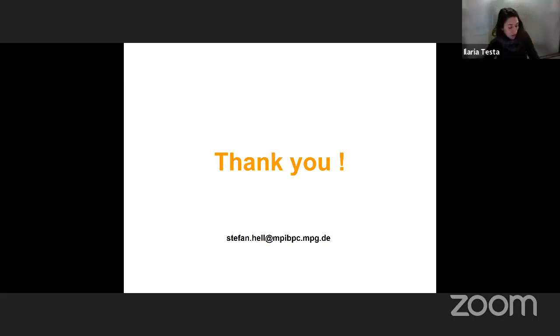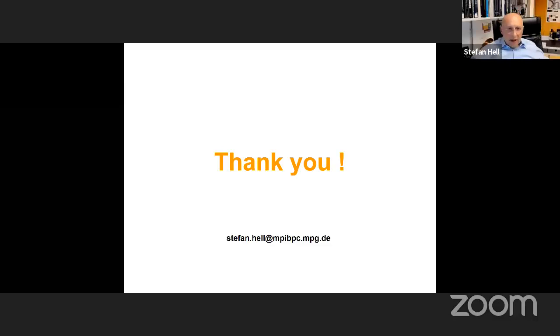Yeah, that's great. Okay. Also on this line, since you mentioned photophysics, if you are talking, for example, with a probe engineer to get a better probe for MINFLUX, what is still challenging in the photophysics? What would happen if, for example, the molecule would blink during this triangulation? How do we handle this? Then you would lose it if it blinks off too much. Yeah, then you lose it.